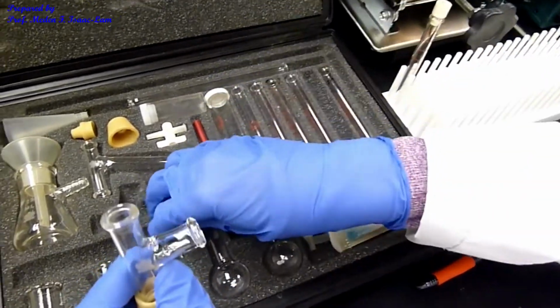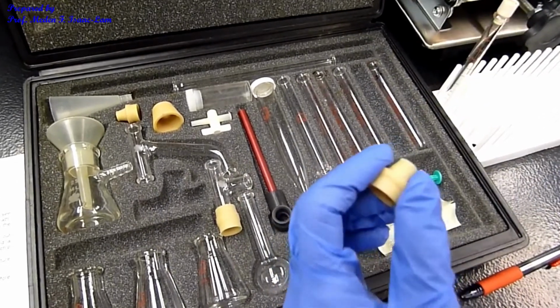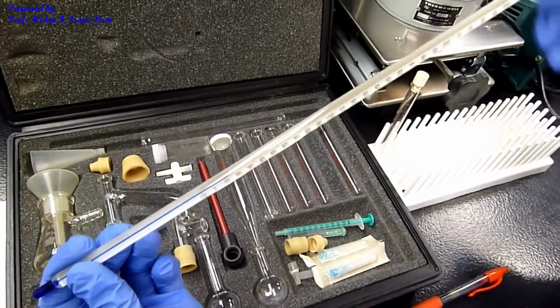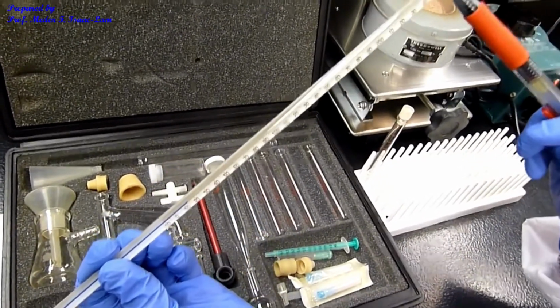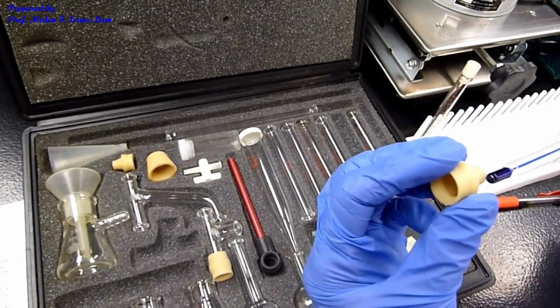And then I will also use this other adapter. And I'm going to be using a thermometer that goes up to 260. So this thermometer in here goes up to 260. Then I'm going to insert it into this adapter slowly.